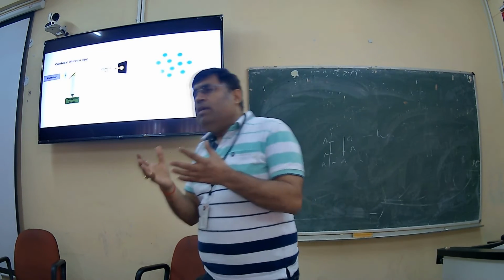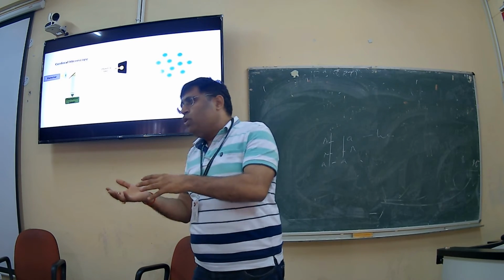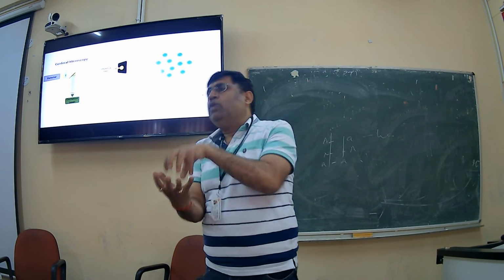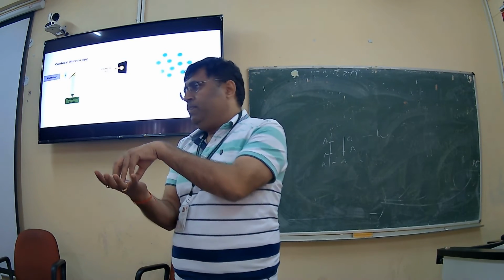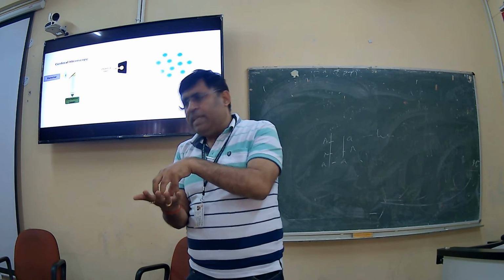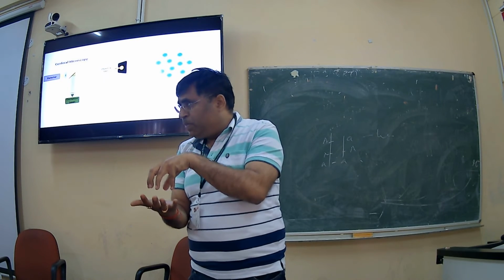There is a difference between the fluorescent microscope and the confocal microscope. In the confocal microscope, the fluorescent emission is from a particular area; it focuses on only one area. Let's say you are reading many subjects, physics, biology, chemistry.